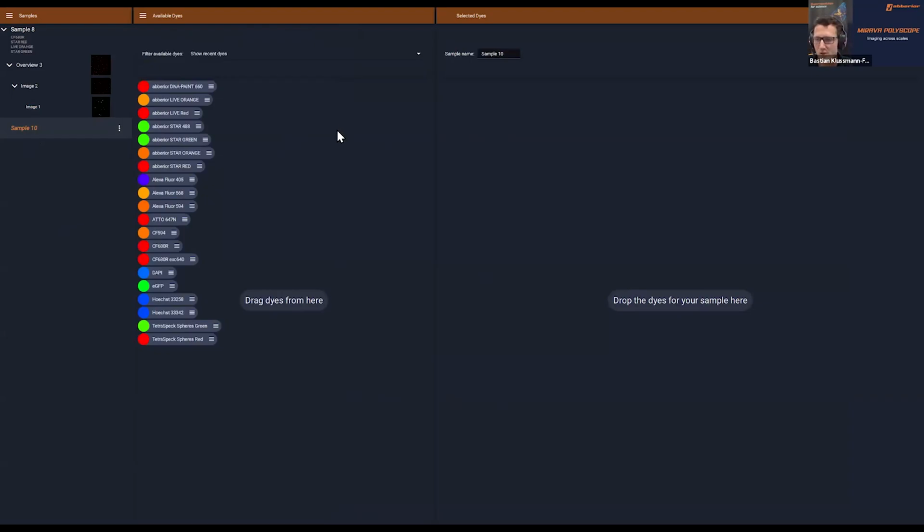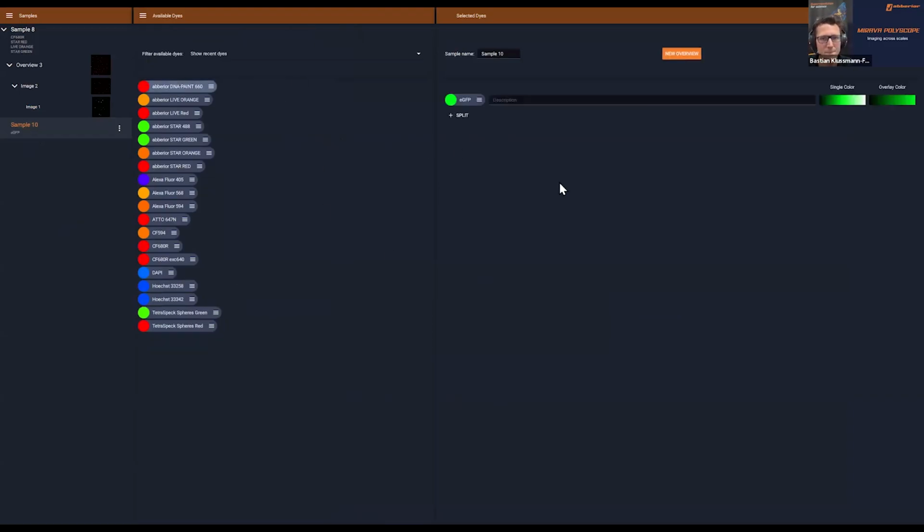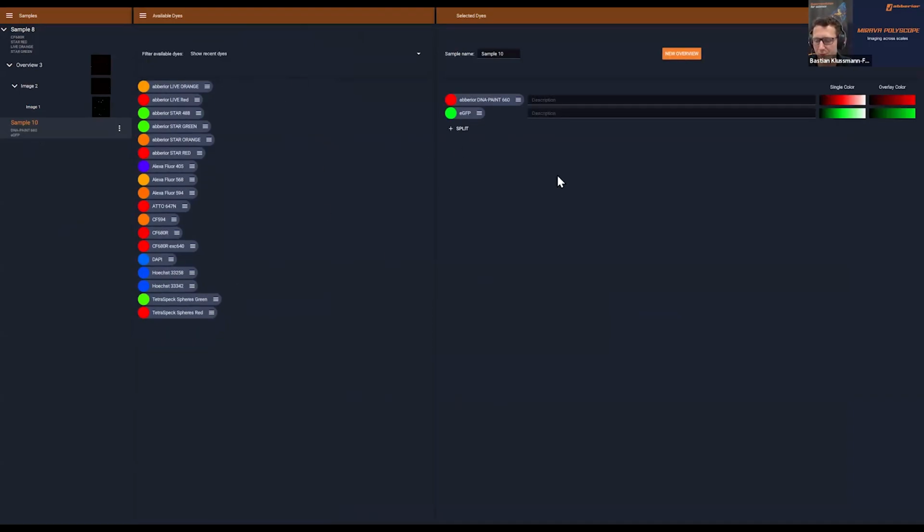And here I will just very quickly show you how to start a MINFLUX measurement as soon as you have a well-defined sample. What we have here is U2OS cells with NUP96 GFP, and attached to that GFP we have a nanobody with a docking strand, and we have an imager strand in the imaging buffer. So it's a DNA-PAINT approach for MINFLUX imaging, where we use the imager strand concentration in the buffer to create the blinking behavior which we need for MINFLUX measurements.